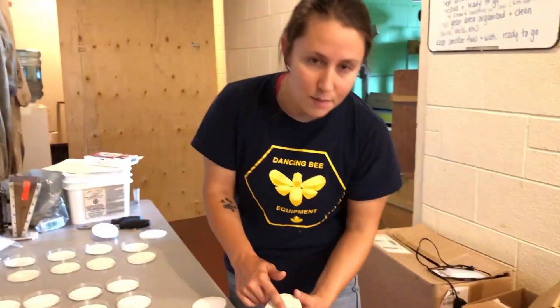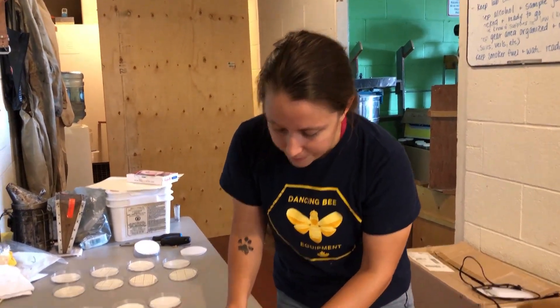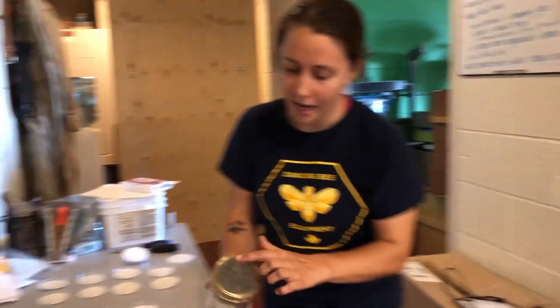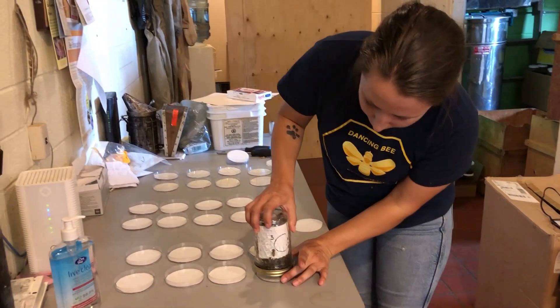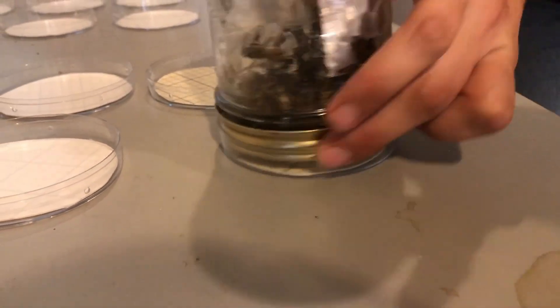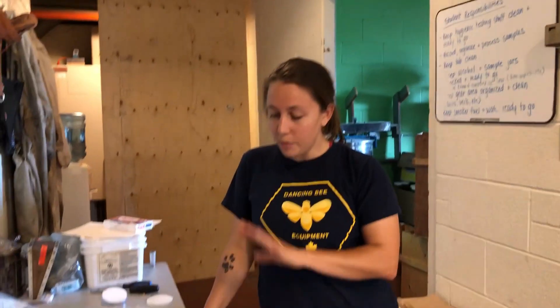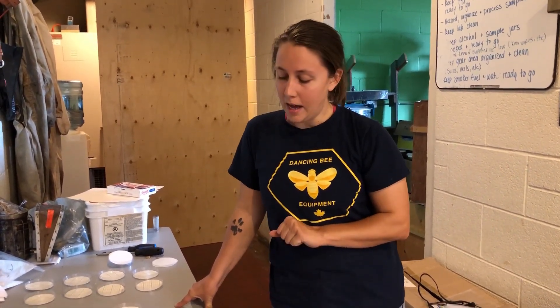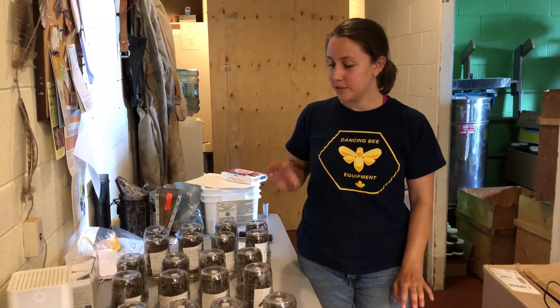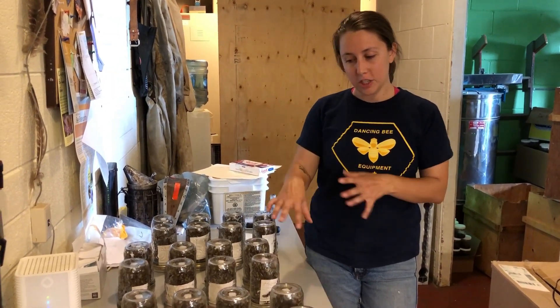These sticky circles are cut out of pre-made sticky boards, but if you just have a circle and want to cover it with Crisco or something else sticky, that'll work just as well. We'll take our mason jars that have the screen — remember, the mites can fall through — and they fit nicely on top. The bees are getting a little bit of ventilation from those holes in the side. We're going to leave them in these jars for 24 hours and see how many mites fall.